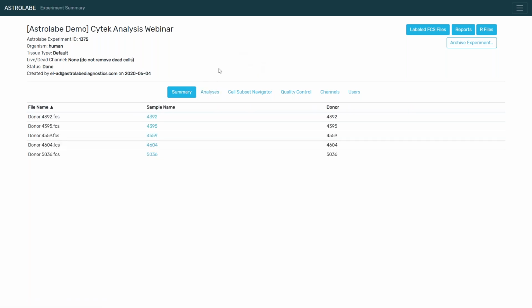So again, many different angles to attack this problem. We've seen some pretty extreme cases of batch effects, including situations where some samples were missing a marker completely, or some samples were fixed and some were fresh. And so far, the platform has dealt with them extremely well.